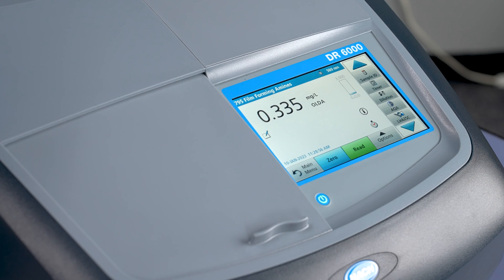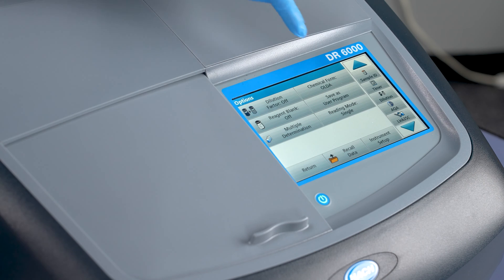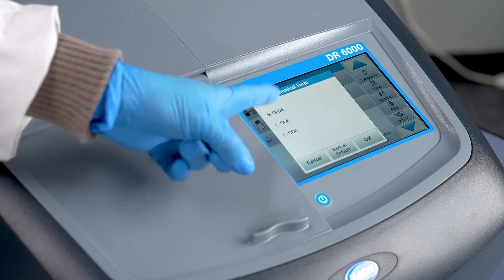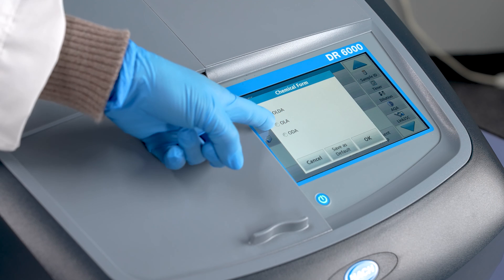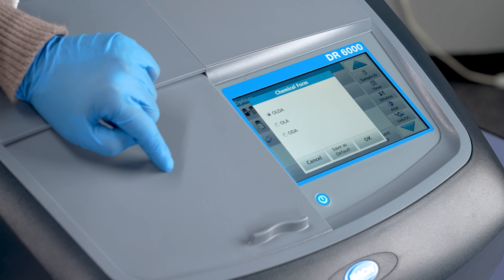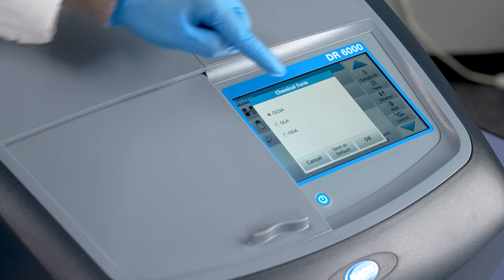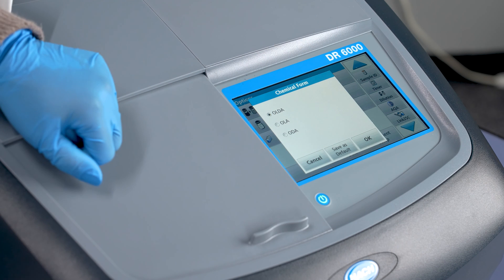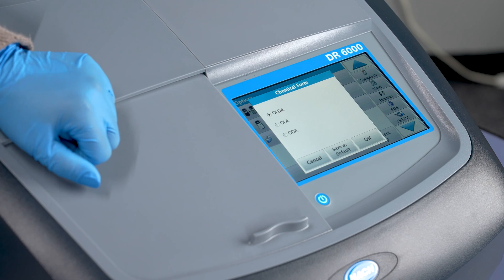However, if you're using a different type of film forming amine, for example ODA or OLA, then the instrument will actually give you the proper reading for those forms. First, go to Options, then choose More, and then choose Chemical Form. You will now see that you can choose OLDA, ODA, or OLA as your form factor. If you're always going to be using one particular form, you can choose that and make that default so that every time you run your test, you will be reading your value in the actual film forming amine that you are using.